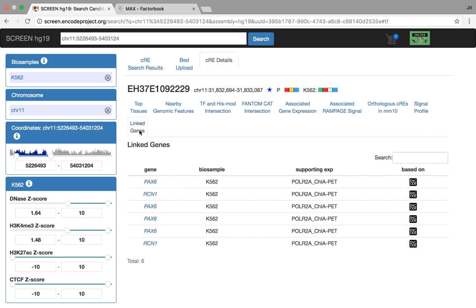One of the projects that Jill's been working on, our enhancer target gene finding, and we're starting to give you an indication here of links based upon ChIP-seq data or eQTLs, and you can also look at the genes involved and also the data it's actually based upon.